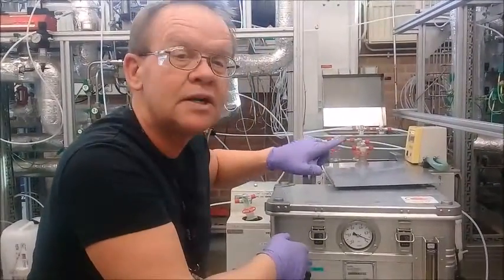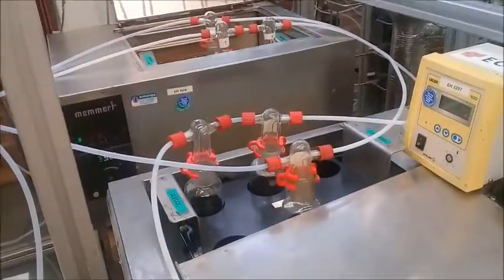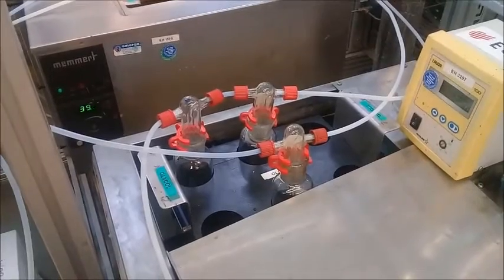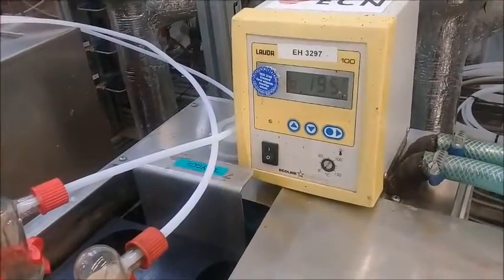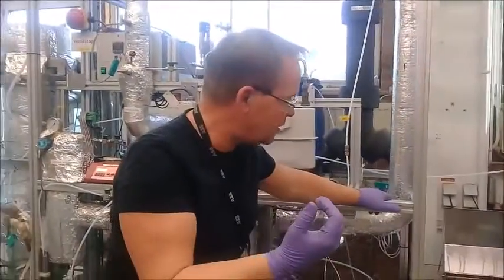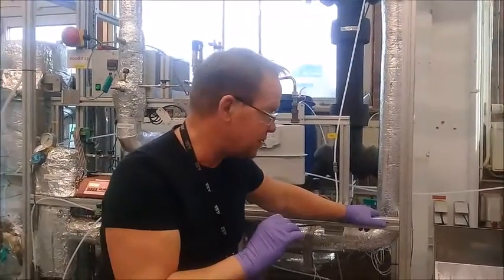So if we start looking at the bottles, we see the gas flowing through the bottles like that. And since we have a clean process already going on, we don't see much aerosols anymore. Sometimes when you have a real dirty process, you see a lot of aerosols coming into the bottles. They will give a lot of smoke and a lot of fume. But now, since the gas is nice and clean, you don't see too many aerosols, but they are there, and they will be trapped in all these 6 bottles.